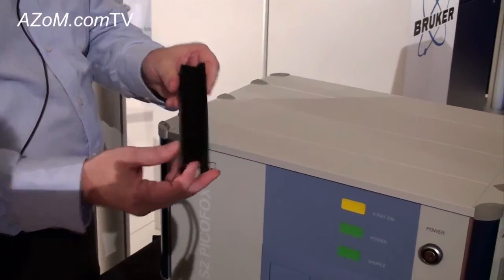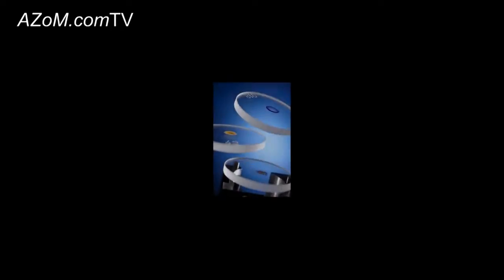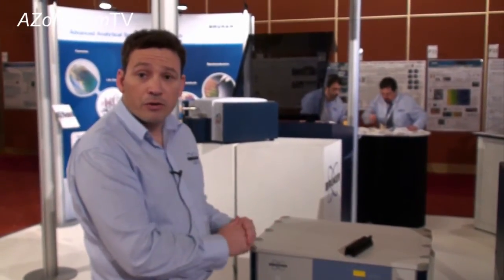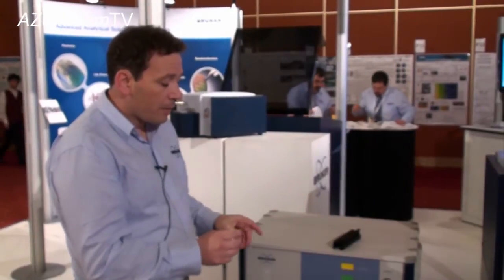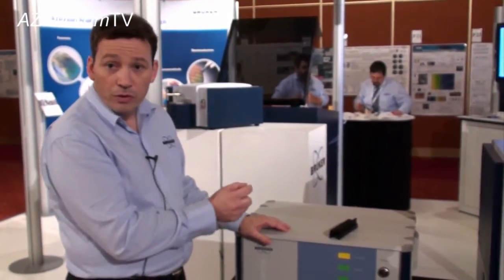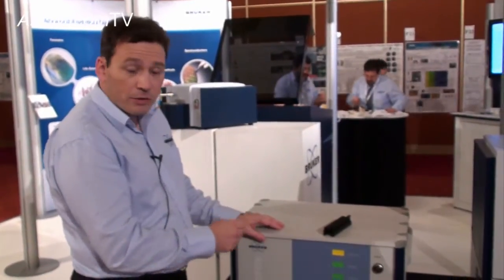You have a sample loader here. The sample preparation for this instrument — if it's a liquid sample, it's generally spiked with an internal standard. Because the instrument has a universal factory calibration, you spike the sample with an internal standard, pipette a small aliquot onto the disc, which is dried, and then placed into the instrument.